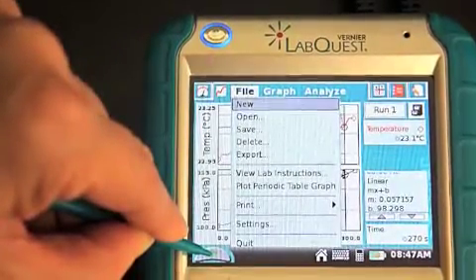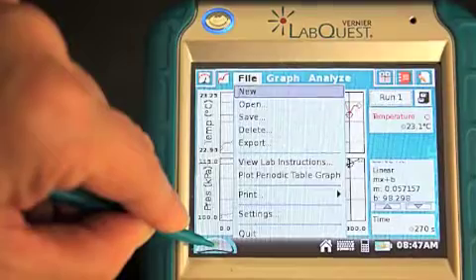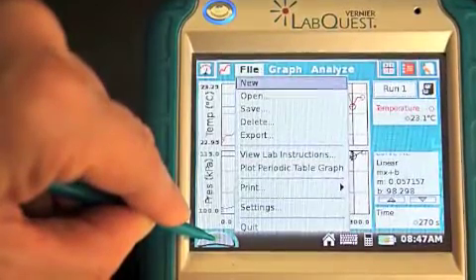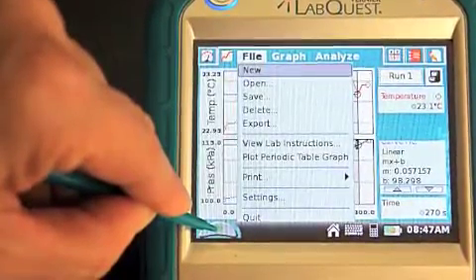Another nice thing about a LabQuest is that it assumes that between different trials, which the LabQuest calls runs, you will want to use the same setting for each trial. So to start your next trial and all subsequent trials, all you have to do is hit the green Start button on the lower left-hand corner.